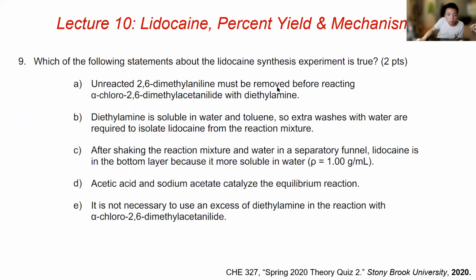And which of the following statements about the lidocaine synthesis is true? So of course, to move on to part B, we have to remove the aniline out. That's true. Diethylamine is soluble in water and toluene, so extra washes are required. Yep, this one was in the lecture notes.